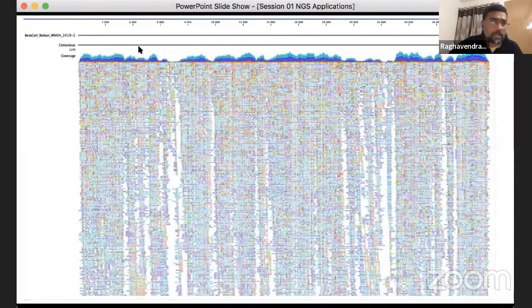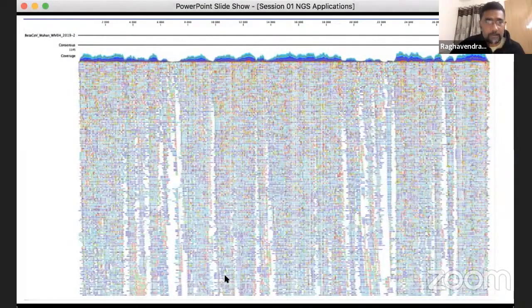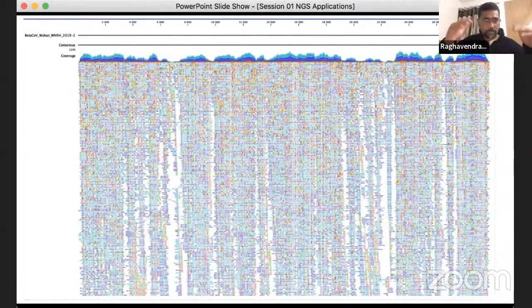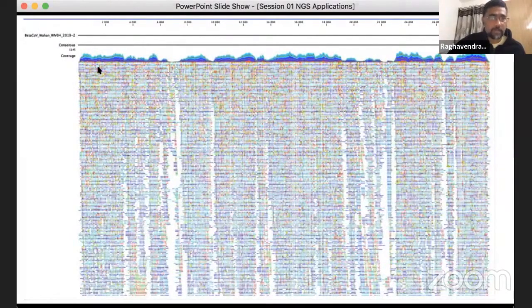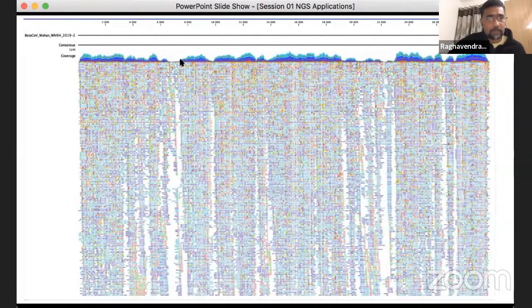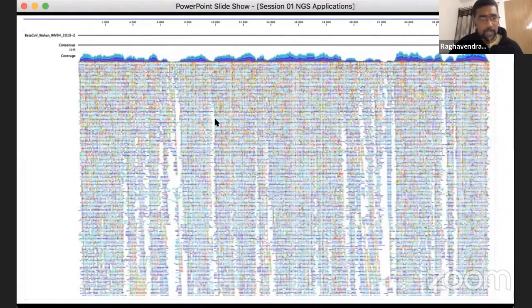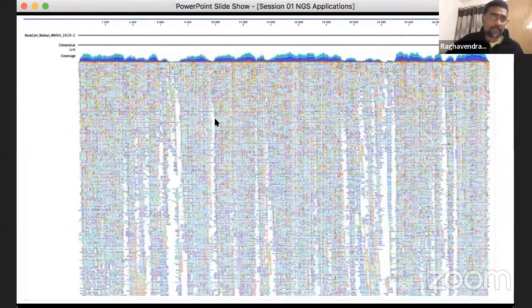Here we have the reference sequence, followed by the consensus and coverage of the mapped reads. We do not have uniform coverage because of the technology — it does not uniformly read or sequence at all levels. These small FASTQ read chunks get mapped to the genome, and coverage varies by position. In some areas coverage is really high with many reads aligned, while in other areas coverage is very shallow because there are few reads at that particular position. In addition to visualizing the mapping, we can also identify specific mutations at these positions.